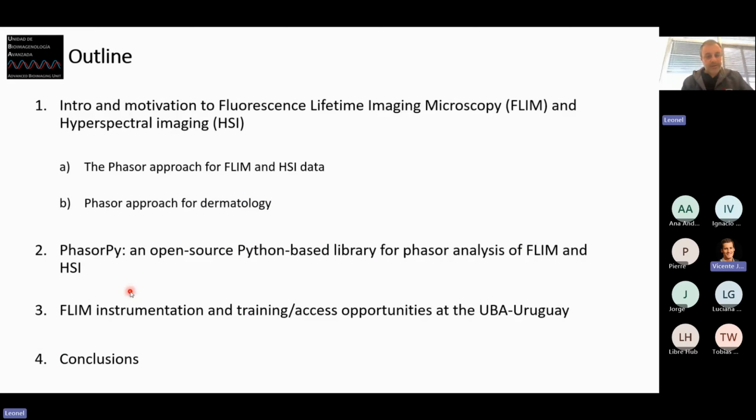Okay, so as Vicente mentioned, I will try to show you a little bit about the motivation of my research with fluorescence lifetime imaging microscopy and hyperspectral imaging, and I will try to convince you how valuable it can be to move into the Phasor approach for the analysis of FLIM and hyperspectral imaging.